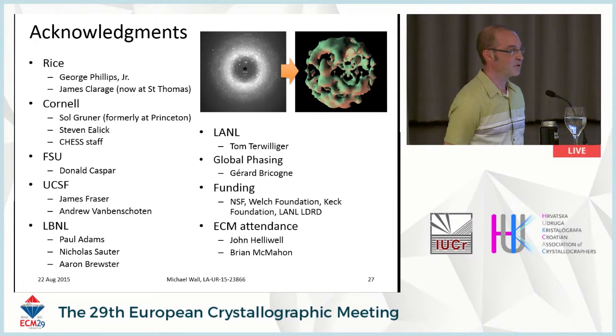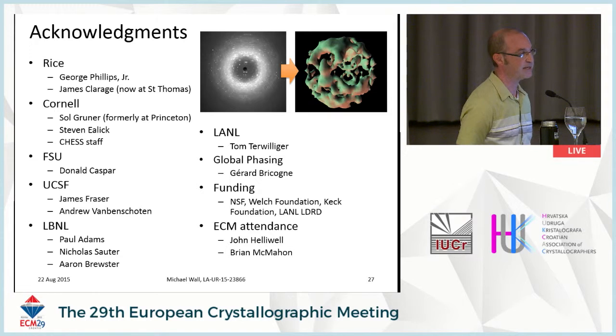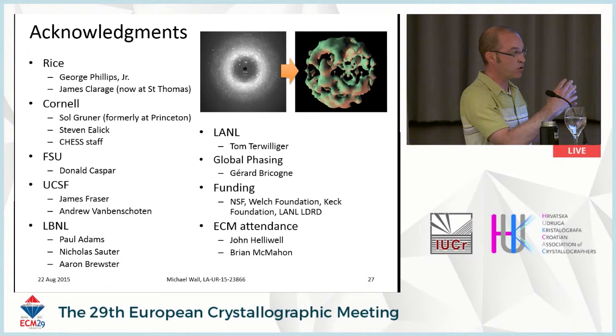Yeah, so that's a good question. I think with diffuse scattering, what we need to keep in mind is that you have a lower absolute intensity on a pixel-by-pixel basis, but you have that intensity spread out over a larger number of pixels. So really, we need to keep in mind what is the actual intensity that we're looking at. So it can be a little bit looser, let's say, or less precisely defined to some extent than integrating a single Bragg peak. But if we look at the features that I'm extracting on the large scale, what we expect is that the total integrated intensity corresponding to the diffuse scattering in the neighborhood of a Bragg peak should be comparable to the intensity of the Bragg peak that's in that neighborhood. So I think the signal to noise considerations should be similar between the two if we look at it from that perspective.